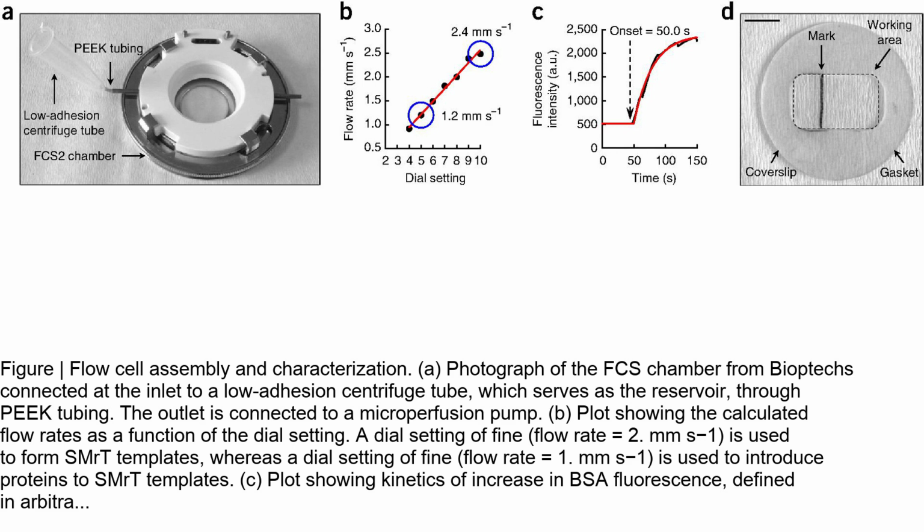The flow cell assembly ensures controlled flow of buffer and enables the formation of SMRT templates. The characterization of flow rates and dead time is crucial for accurately interpreting the results obtained from subsequent experiments.